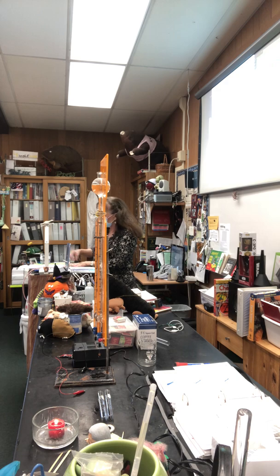So what we do is we put in electrolyte to help the electric current flow through this better. I'll talk more about that in a second. Out the bottom are copper wires for conducting electric current. Off on the side is our AC to DC converter box. So we're taking alternating current from the wall and making it into direct current, which is like a battery. And it'll be 12 volts.